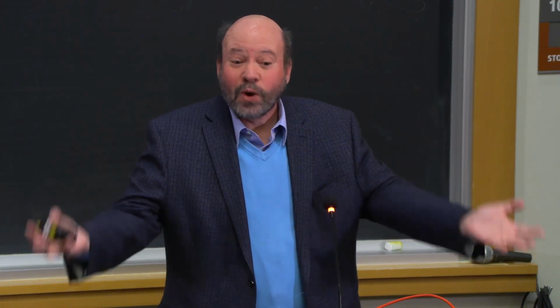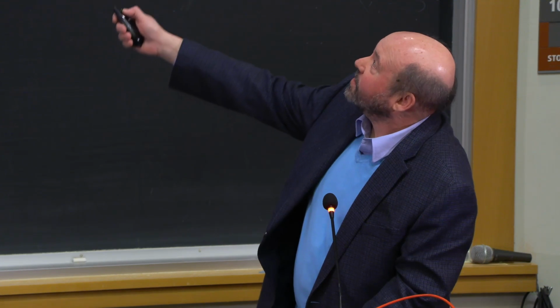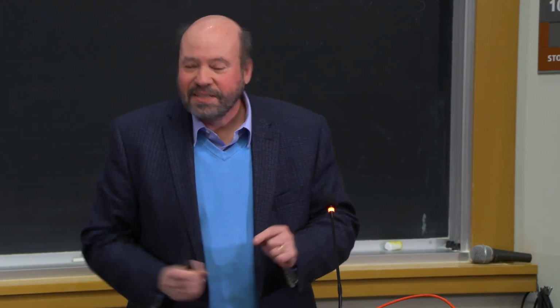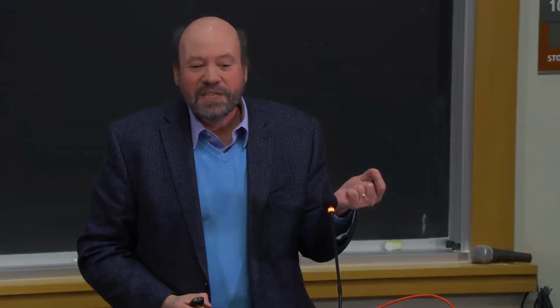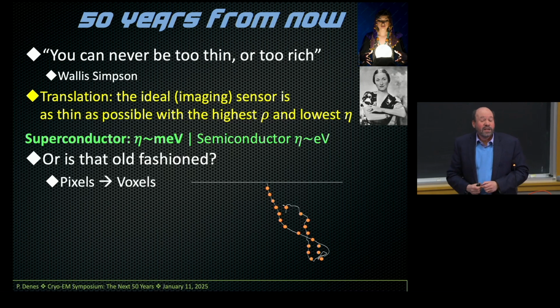I only know what countable quanta are. So I get some number of quanta that depend on this thing, and the problem is this value has fluctuations called the Fano factor. So there's an intrinsic limit to resolution that all depends on this. So if we get enough countable quanta, that gives you the energy resolution.